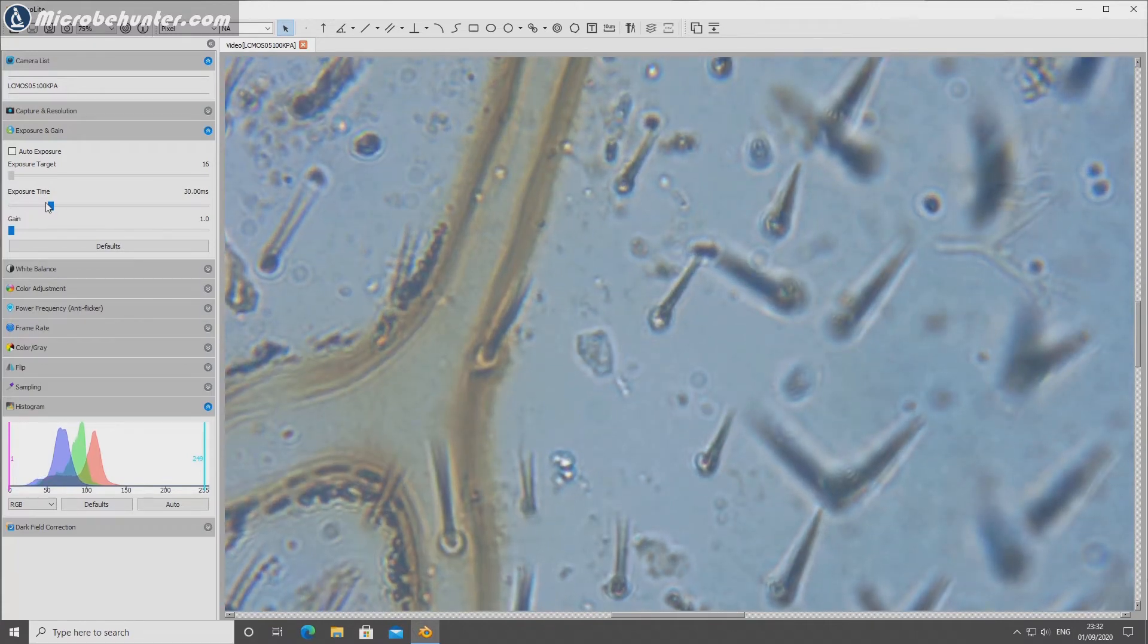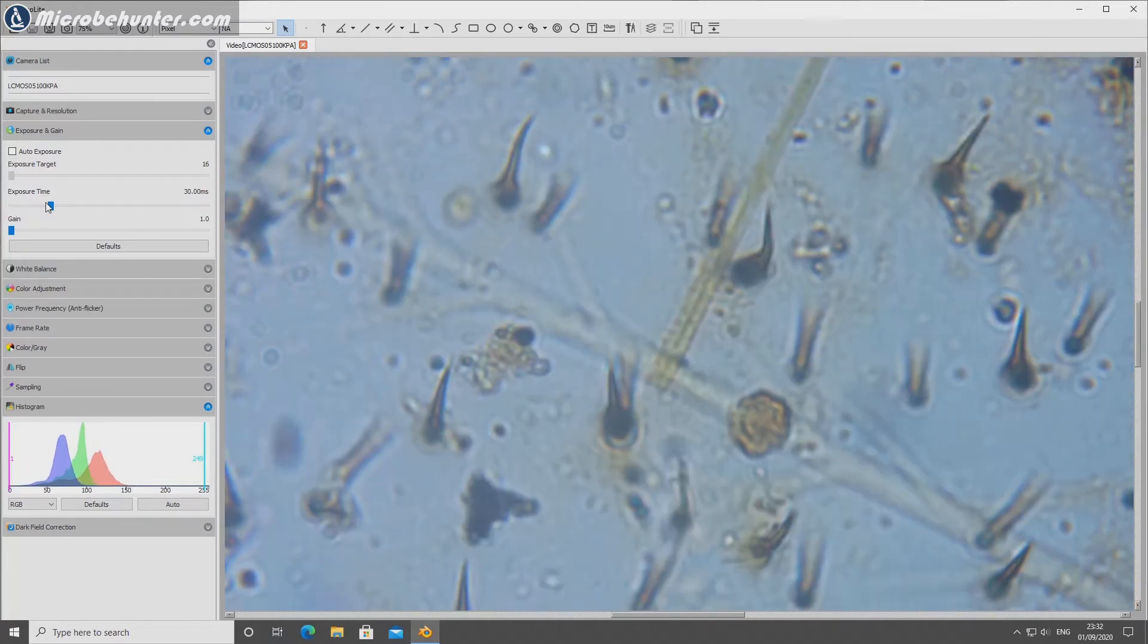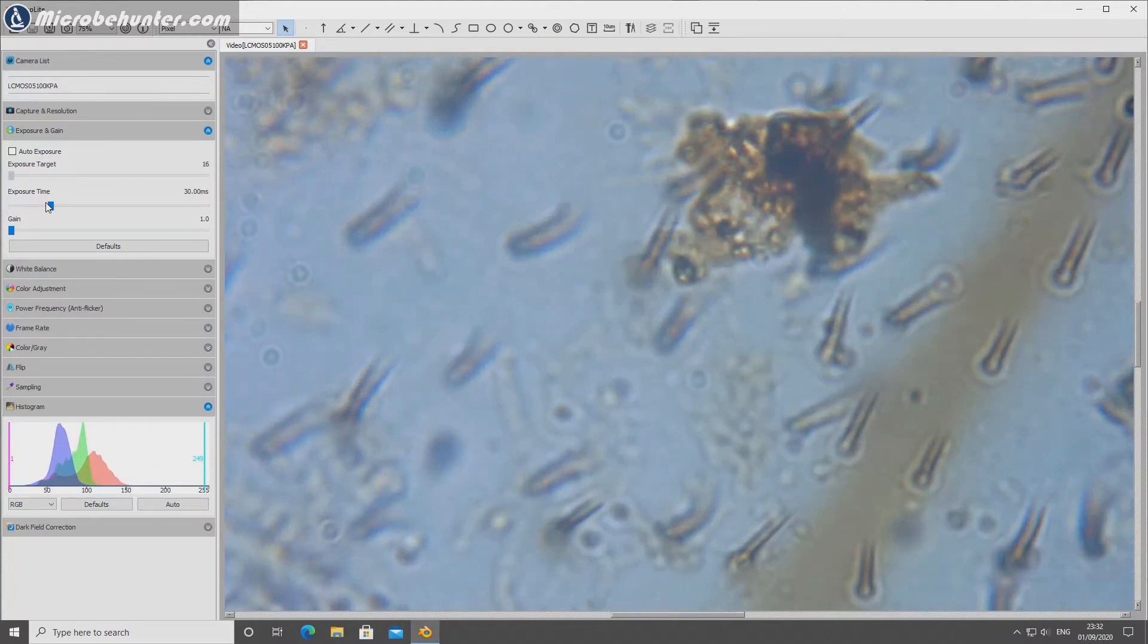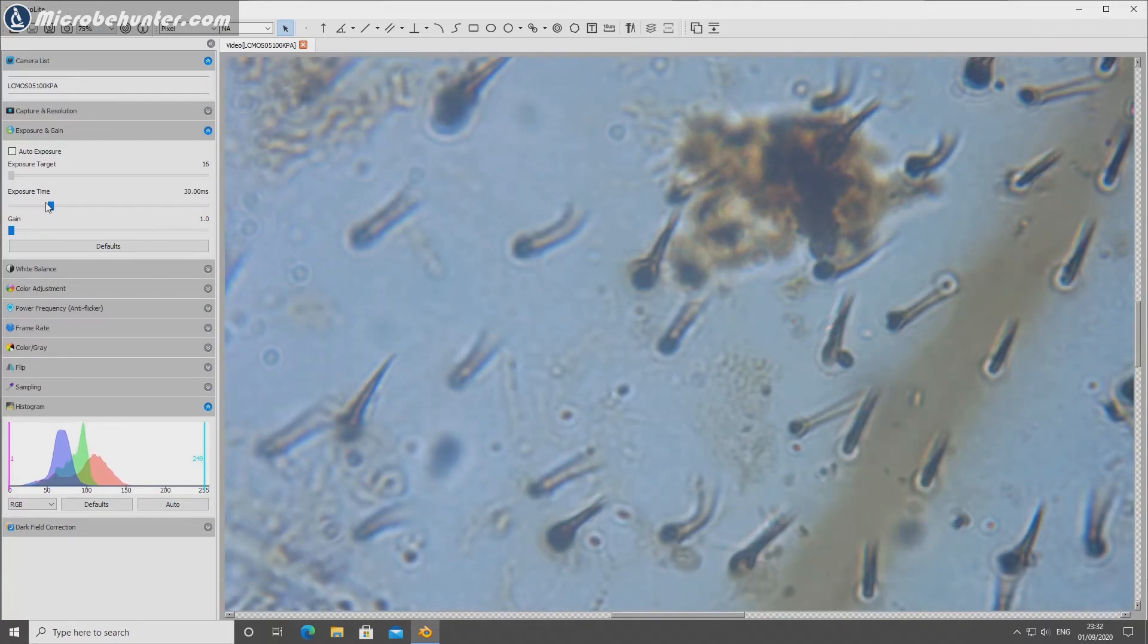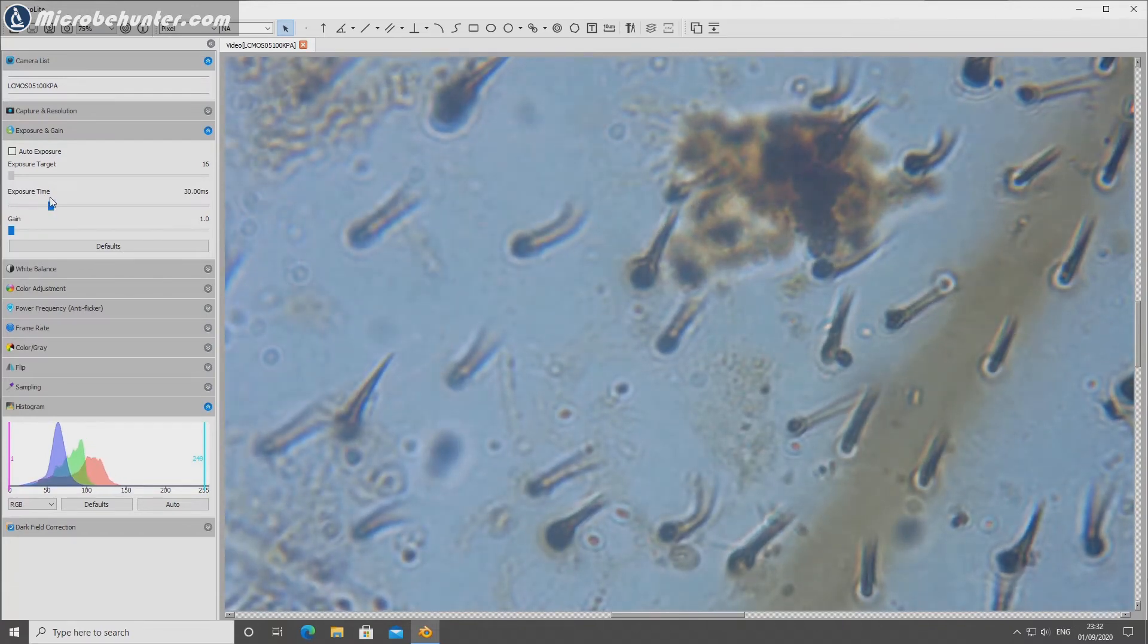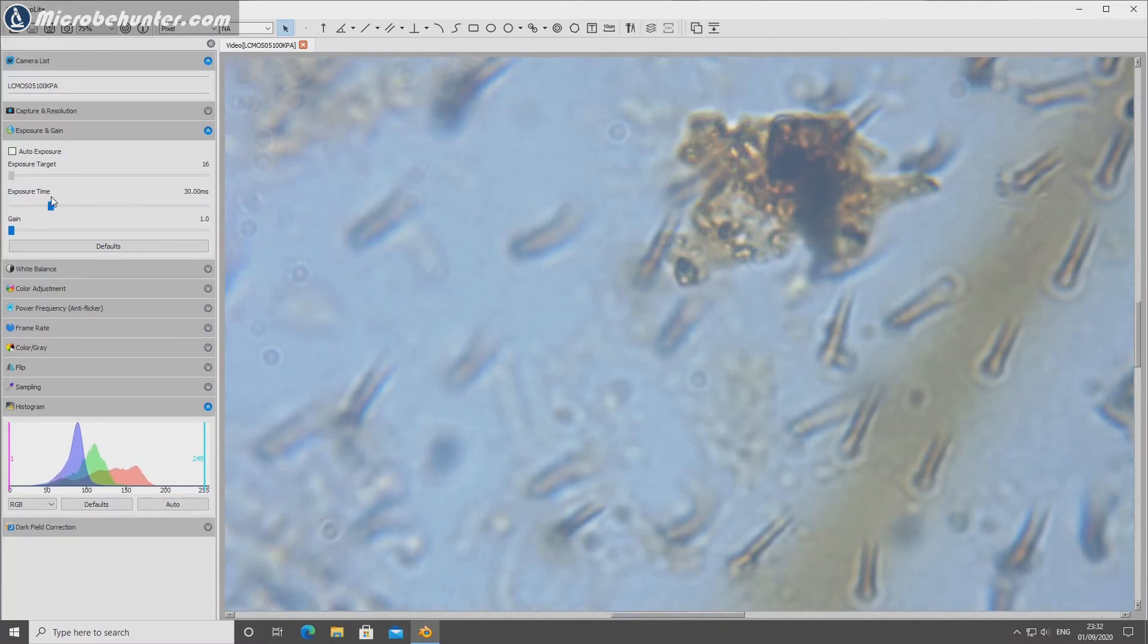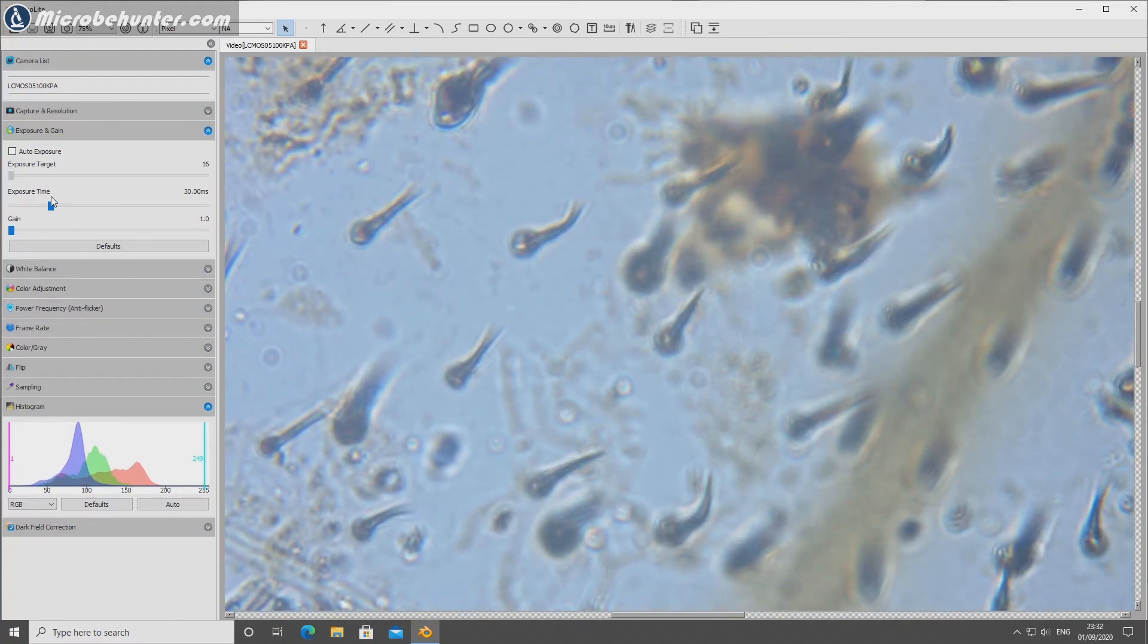It is still possible to be precise enough. It does not have a condenser, the microscope. This of course simplifies everything a little bit for children but this of course does not allow me to control the depth of field but then again this is something that's normal for introductory and children's microscopes. You want to keep the system simple and also low-cost.